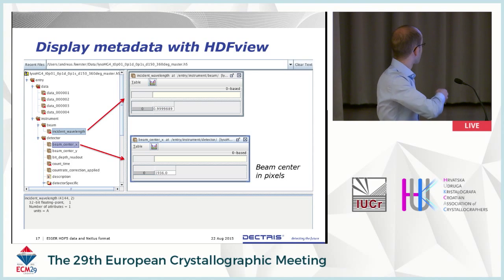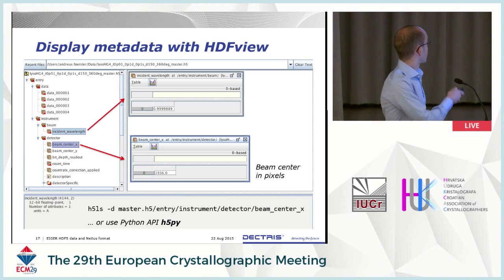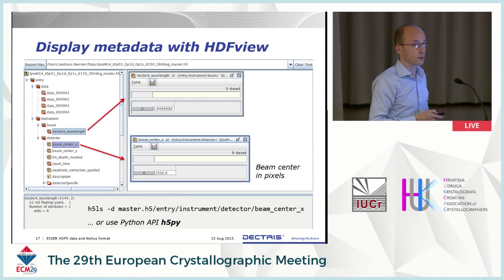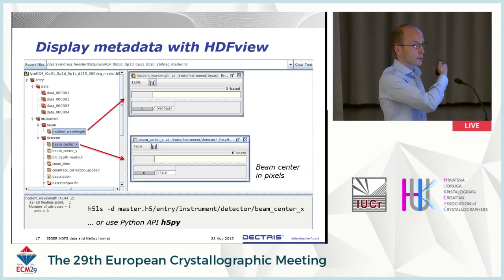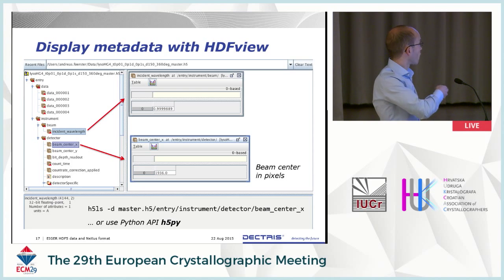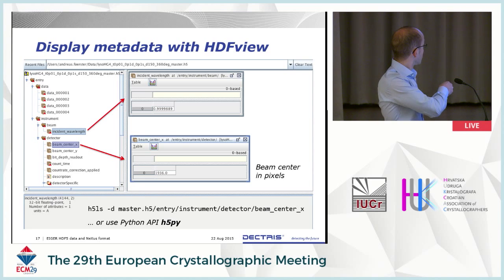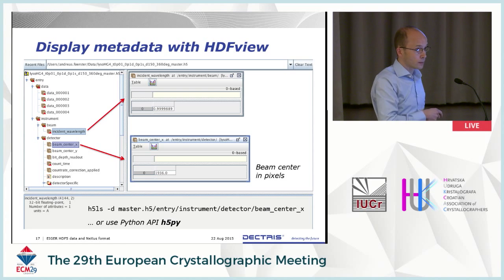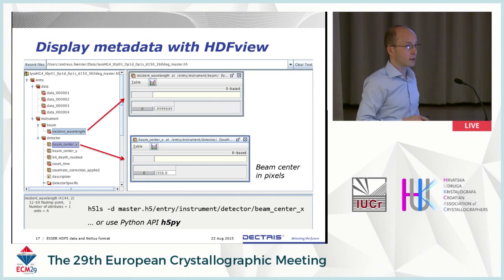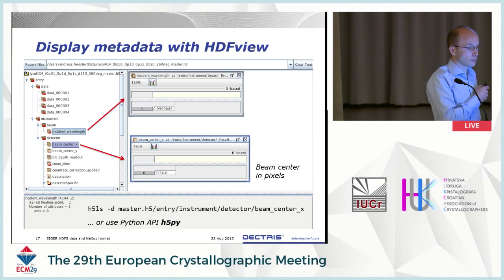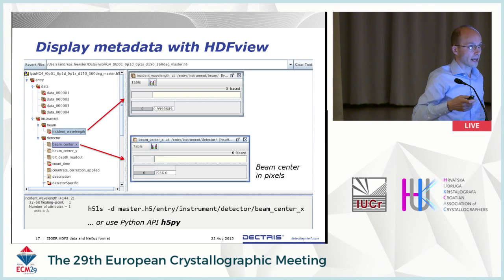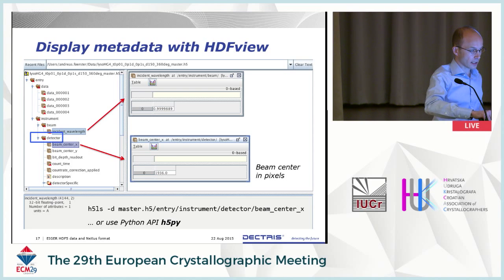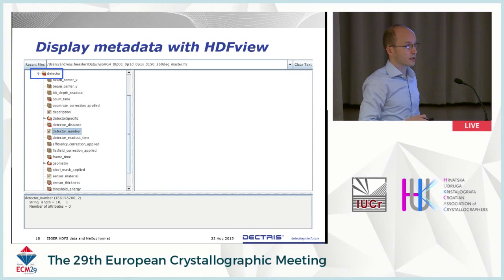There are command-line utilities from the HDF5 library — you can run h5ls with the -d flag on your master file and get the full tree: entry, instrument, detector, beam center x — giving you the corresponding value. Or you can use a Python API called h5py that allows you to read from these master files or even write and add data to them. Under the detector field there are overall maybe a few dozen parameters that are saved.